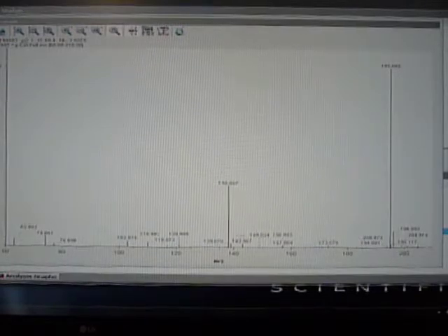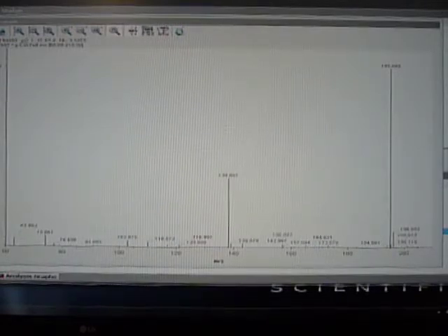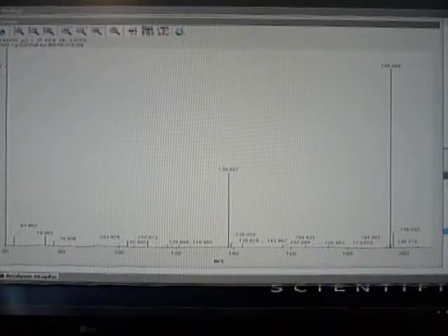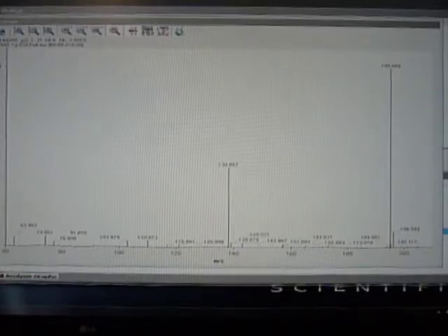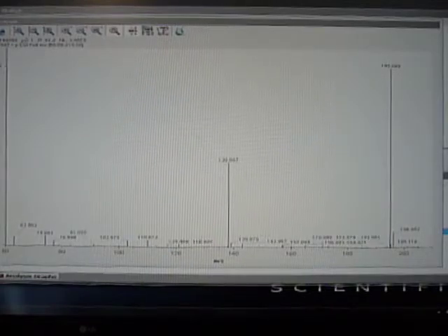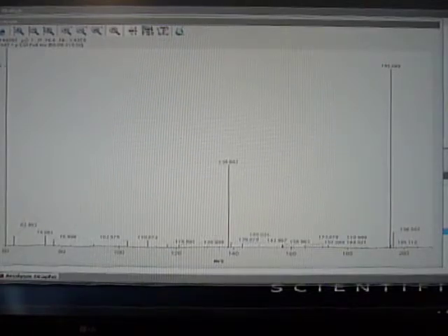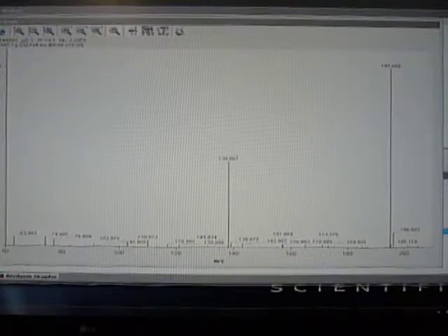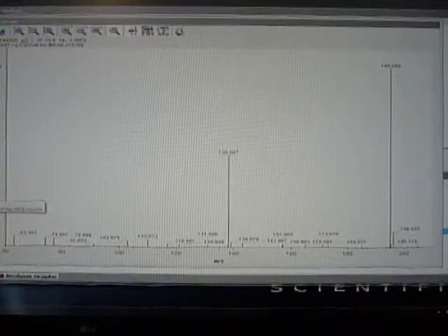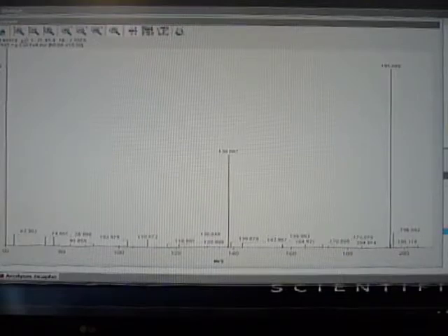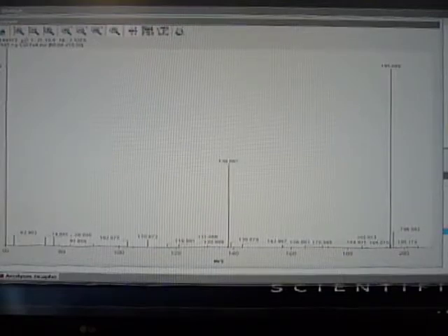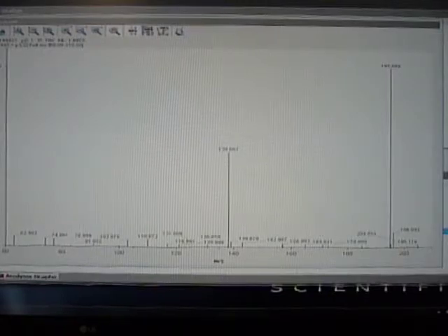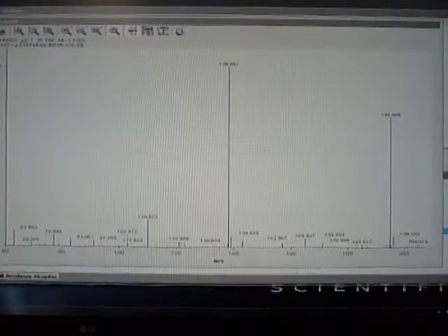And look, we have our fragment. This is because caffeine has to make its way through more nitrogen before it makes its way into the mass spec. And now, if we increase the skimmer voltage to 40, this should happen.